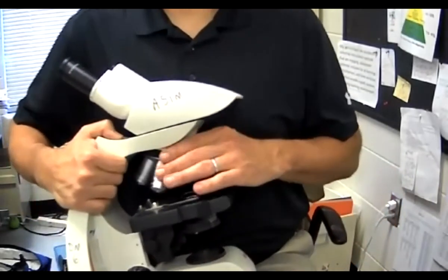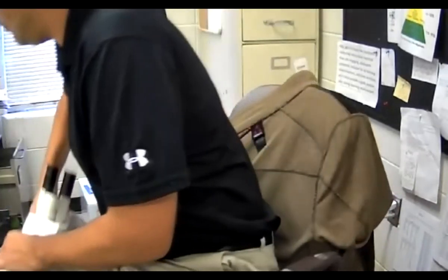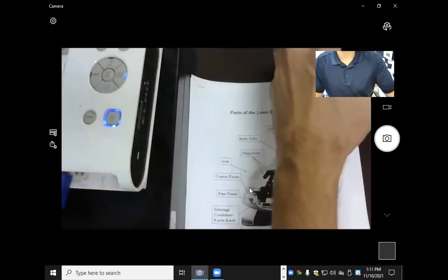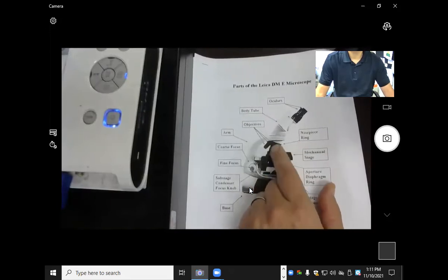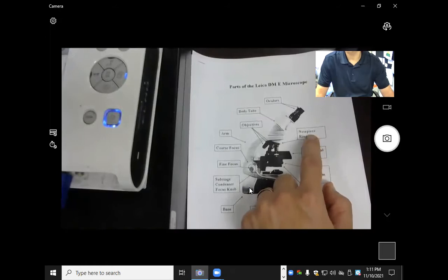Those are some of all the parts of our microscope. Let me show you the reference sheet they gave me. You can see that they have oculars, body tube, objectives, and nosepiece ring or revolving nose piece.